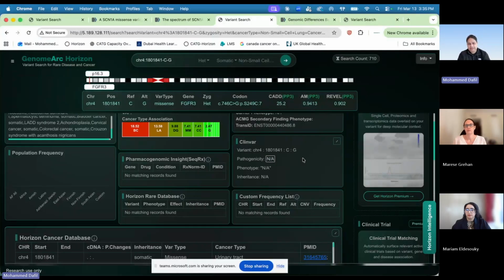So yeah, as much as we can bring into our rare disease database, and populate with many patient information, it will be more impactful for us to resolve this unresolved VUS. Yes. So looking at, yes, I think so. Collaboration and evidence will surely maximize solving VUSs.